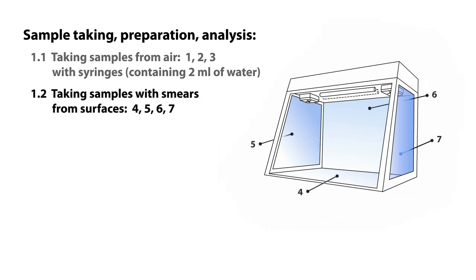Four samples are taken from surfaces with smears. For taking samples, we have outlined smear taking puff. After taking the samples, smears put inside a tube.